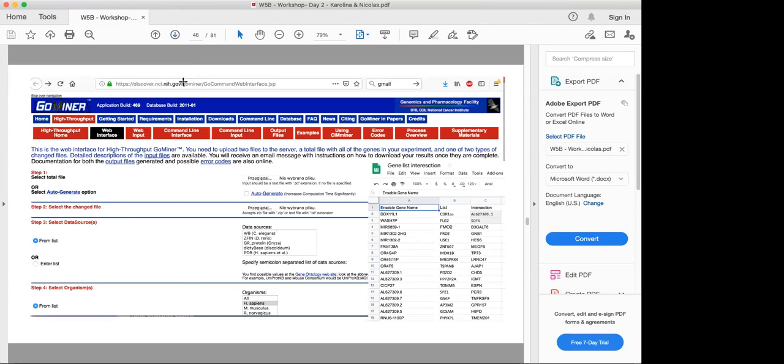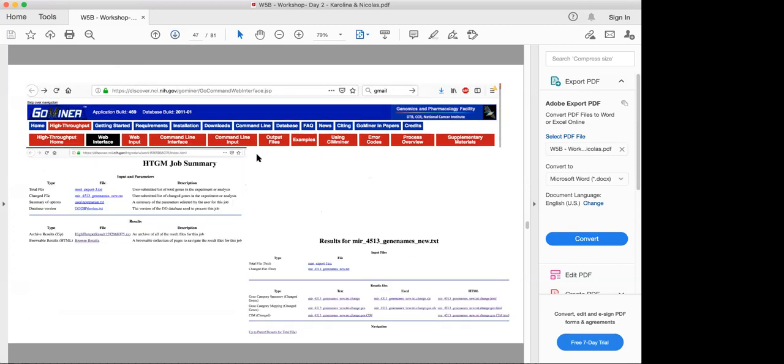So you see NIH.gov, but also please check, because sometimes when you run the analysis, the names that you will receive would be different from the names of those genes that are included in the GoMiner database. So check exactly if you have any differences, maybe you will have to run some kind of intersection so the names of the genes would be a good fit to use as an input to GoMiner. But what I like about this website is that they send you the results to your email. Okay, so after you run the analysis, you should expect to receive the emails with the results.